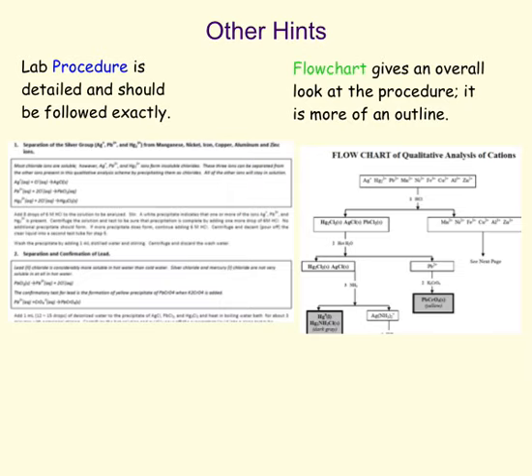Other hints. You have 2 things that you should be looking at during this lab. One of them being a detailed lab procedure. You should follow this exactly. And the other one being a flow chart. And the flow chart gives you more of an outline. It shows you the overall look of the procedure.